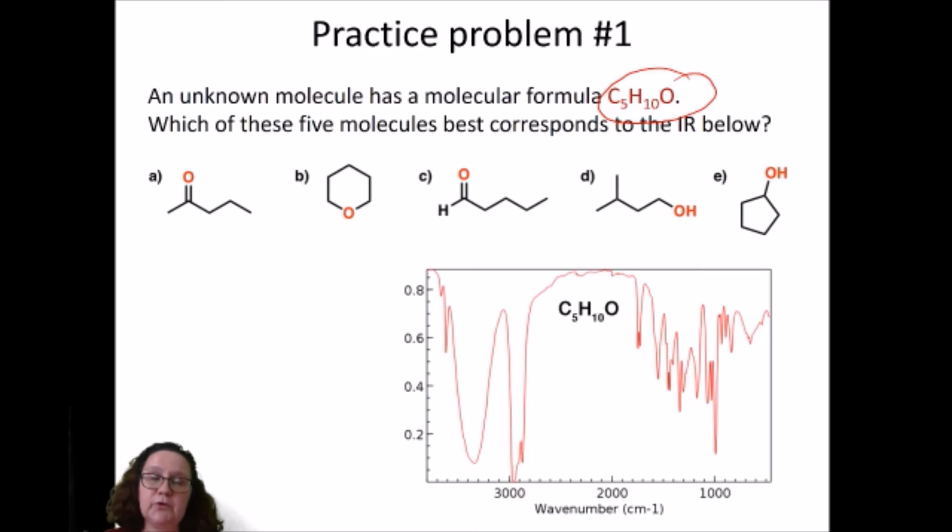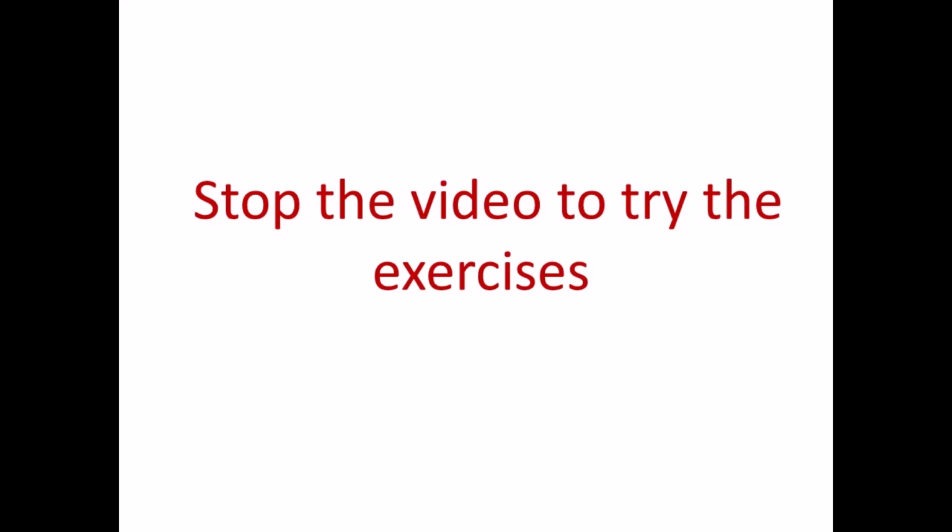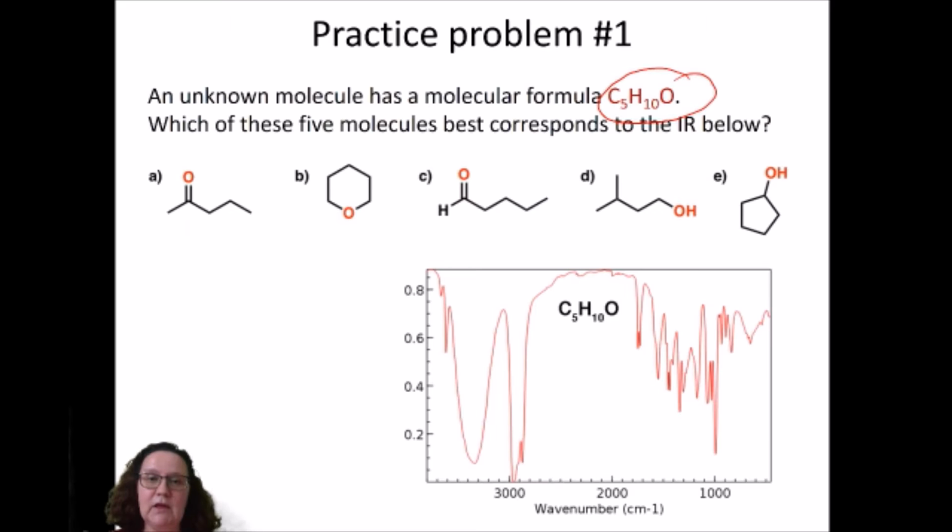Before you start the problem, think about it. Try to identify the key functional groups for each of these options and see if you find those bands in the infrared spectrum. So stop the video now, please. Hopefully you have stopped the video and had a go at the exercise.